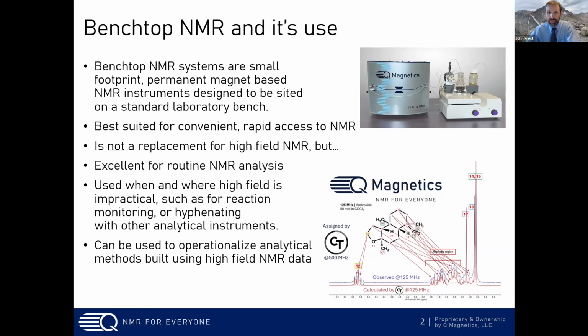And once you have that information, using a combination of that data, tools like HQS, in order to translate that high field data into what we would expect to see at a low field, so that you can then replicate it on a regular basis in a more cost-effective and time-efficient manner.